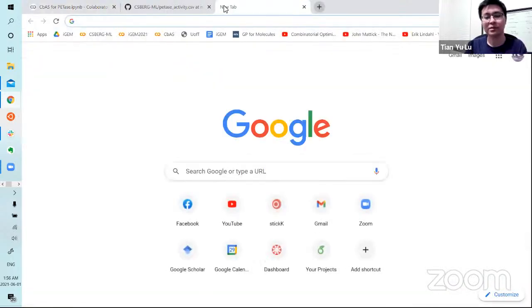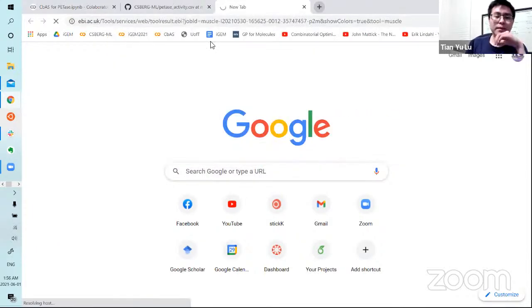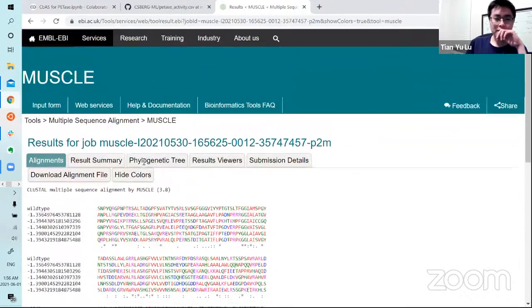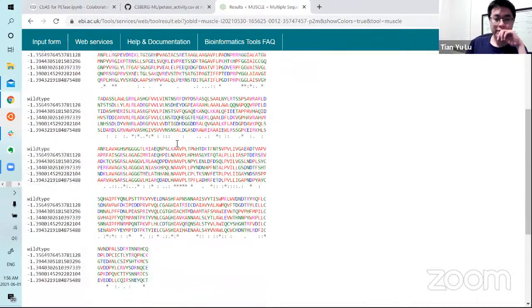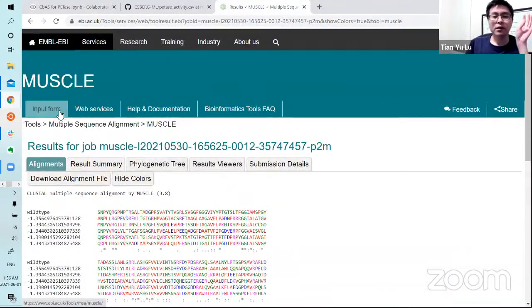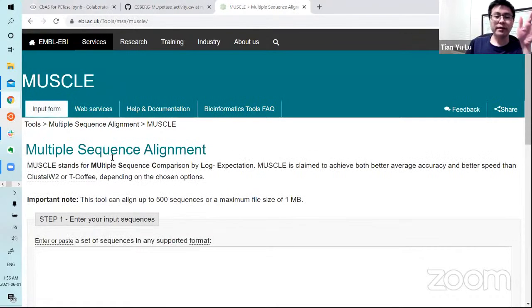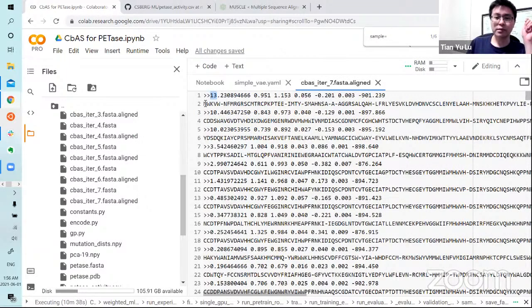Let's just align some of these sequences. I don't know what to do. This was with protein solver. You can see how well it aligns, right? These blocks are sort of still consistent. I think what is a red flag is if it has to do so many insertions and deletions for it to do the alignment properly. So let's just, for curiosity's sake, take a look at this first entry.